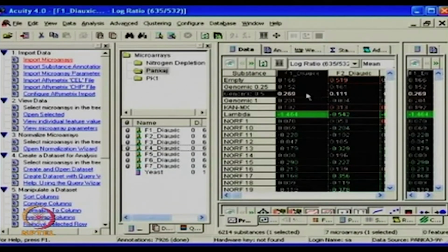Yep. One way to look is the numbers, which is a little cumbersome. The other way people like is color. If you carefully observe, the coloring scheme here is red, black and green. Yeah, maybe you can tell that it's a conventional theme for the microarray. People always represent these colors. So what does each of these color codes mean?